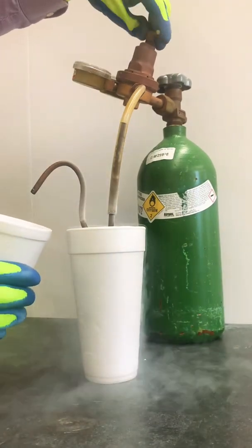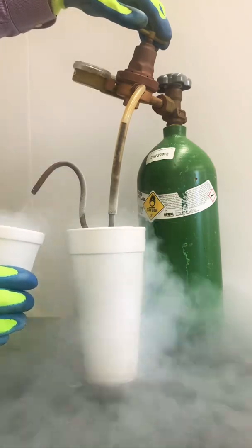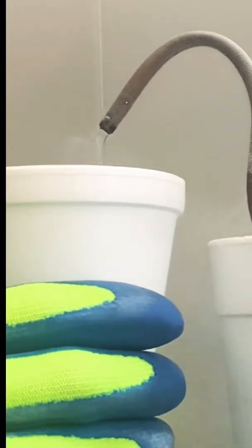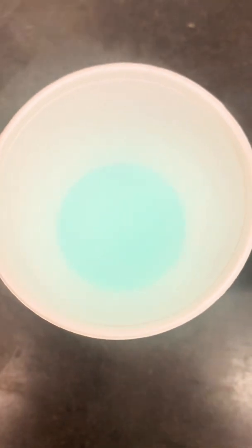The liquid nitrogen is so cold that the oxygen gas flowing through the coil will get condensed into a liquid. By zooming in, we can actually see the liquid oxygen coming out of the copper tube. Check this out — the liquid oxygen has a slight blue color.